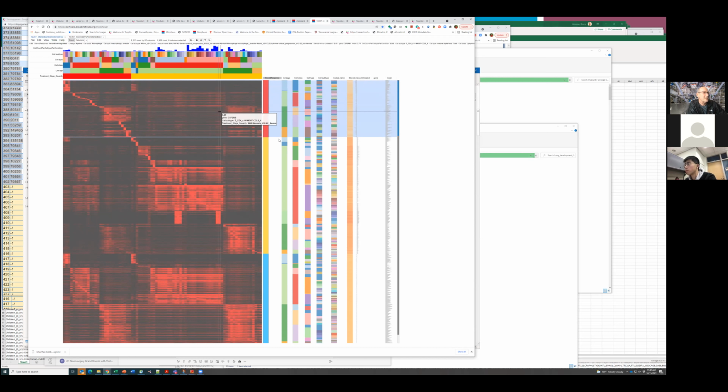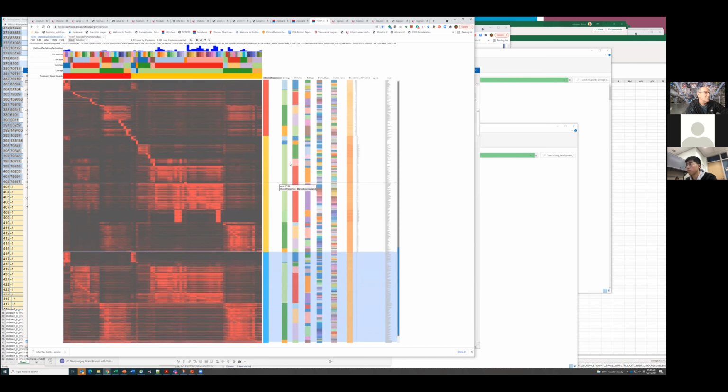And then over here are genes that are all upregulated by steroids in the corresponding cell types as you go left to right. Whereas down here in blue are all the genes that are similarly expressed independent of the steroid treatment or not. And so the next step is to unravel what these genes are up to.